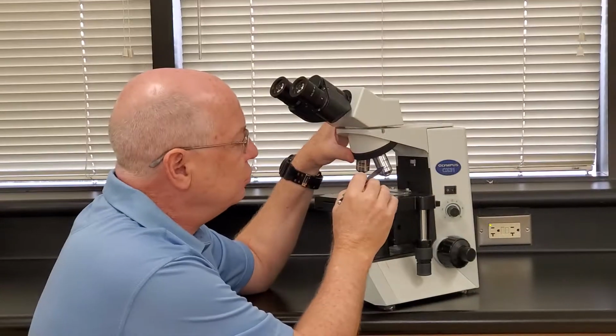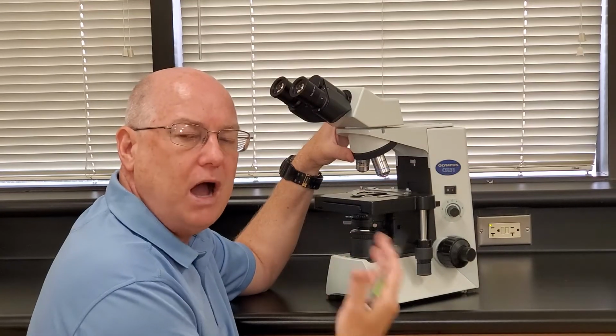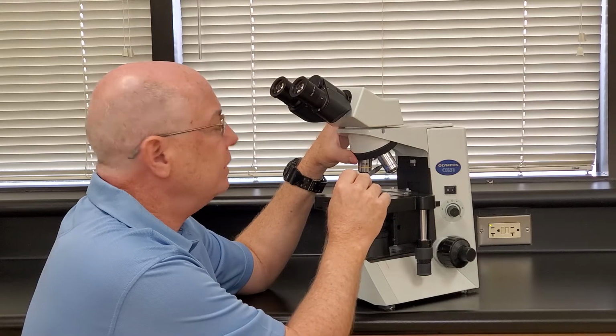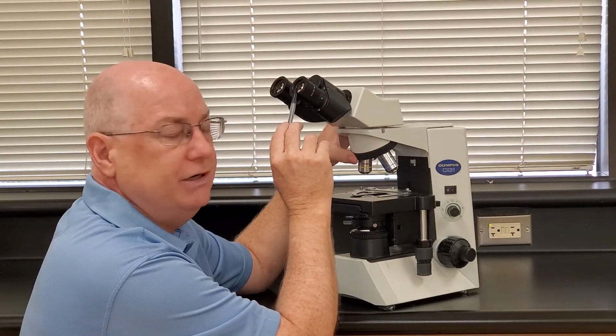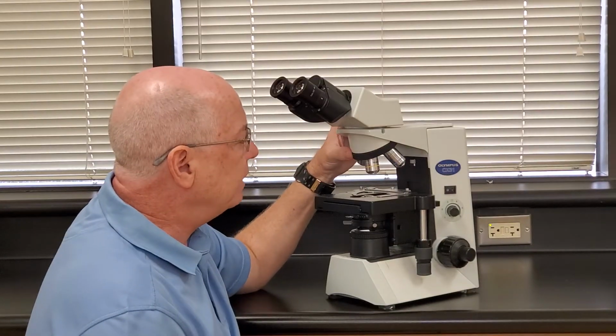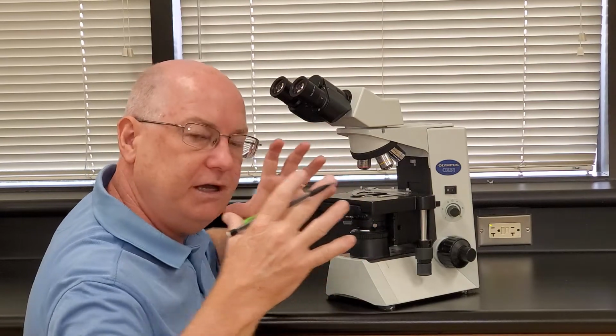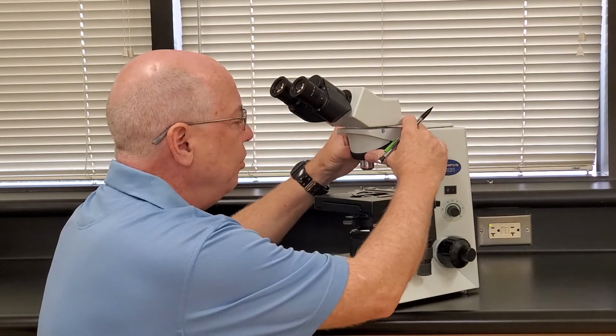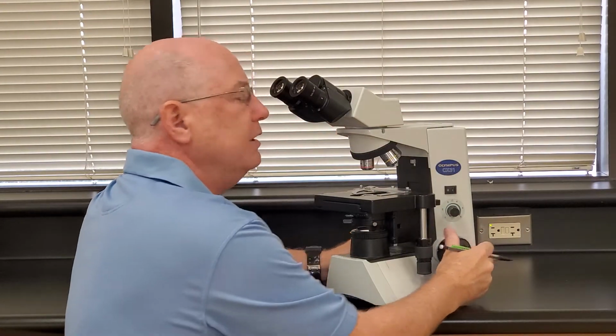And then the last one, the blue one, is our high power or high magnification objective. It has a 40x on it, and times another 10 would be 400 times larger. So it will make objects look 400 times bigger than they really are. And that's the way that we're going to increase our magnification if we need to look at detail under the microscope. So when I have a slide on here, if I have the low power objective and I'm focusing, it's going to look 40 times larger than it really is.